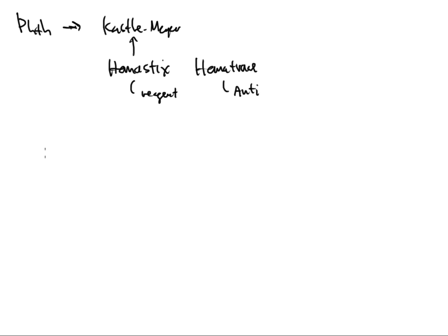All right, so what I want to talk about now is another way that we can identify a blood sample. And not just identify a blood sample, but maybe see a blood sample that normally we could not have seen before. What do I mean by that? Well, this next test is going to use UV light. That's all that it's really going to do.